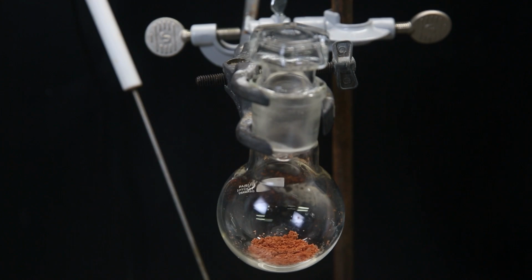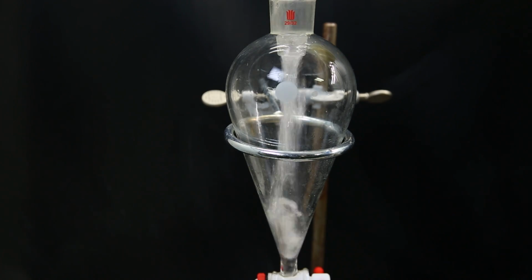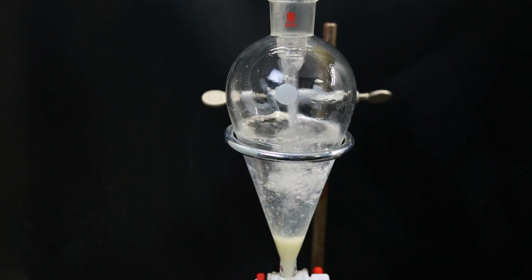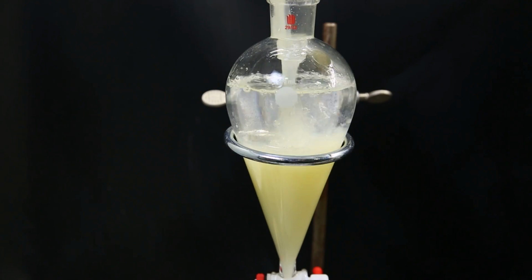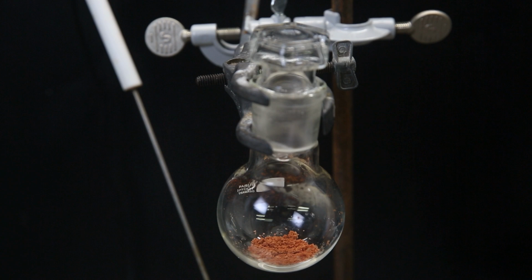Also, I haven't been watching the pH of the solutions too well, which is important to know and adjust, so that all the product moves into the correct layer. If the pH of a solution in one of the steps was not right, it could cause a huge loss of product. If I had an NMR, I could test the product after each step, but at least the procedure turned out to work, even without me being able to check the reaction progress.